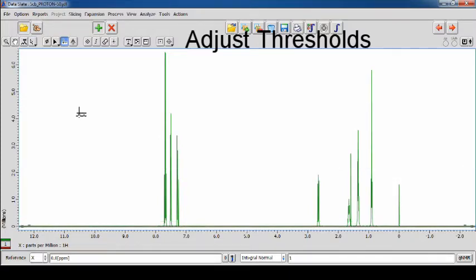Pressing the R key will recalculate the peak, noise, and the base plane. Take care not to place the peak or noise threshold too low, as the program may refuse to automatically pick peaks due to exceeding its peak limit. If this occurs, the main dialog box will inform you.